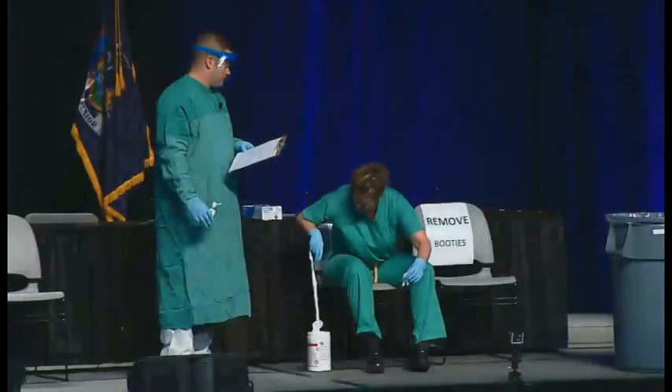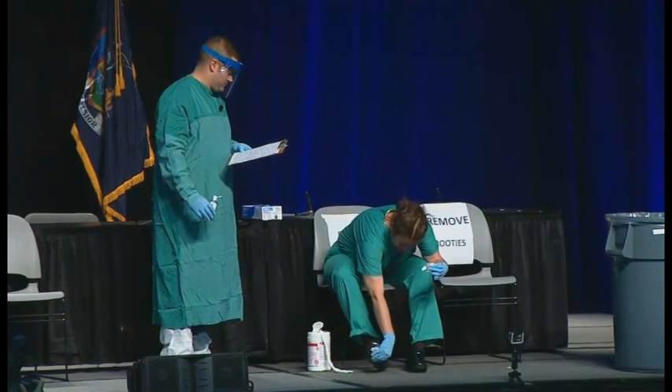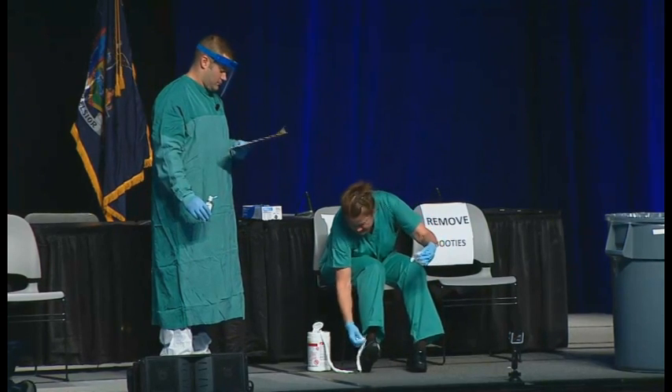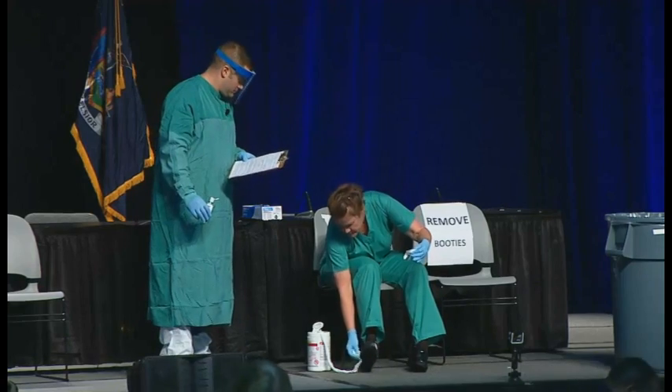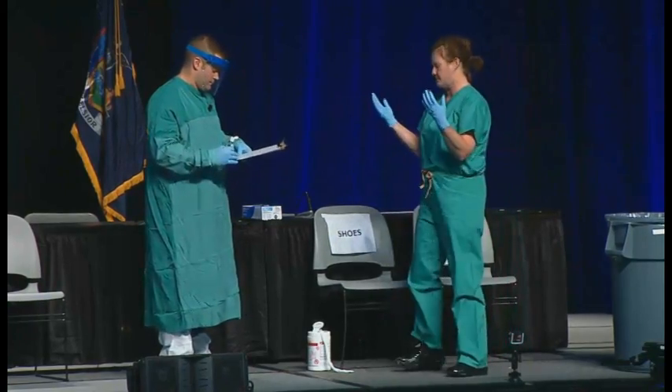Now Barbara is going to sit on a clean chair and use a disinfectant to wipe clean her shoes. Her shoes were under the boot covers, but for margin of safety we're going to disinfect the shoes anyway just to be safe. It's really important to have chairs in the area where you're taking off the protective equipment — it's much easier to do a lot of this when you're seated. You need these two chairs: one that you sit in when coming right out with your gown that could be potentially contaminated, and one after you've removed the gown.